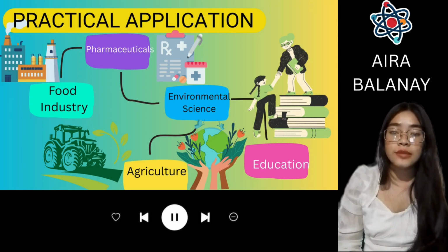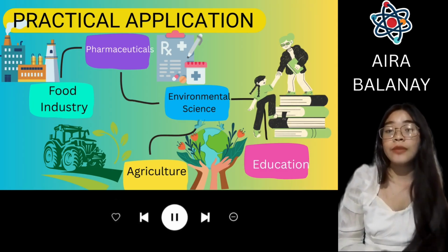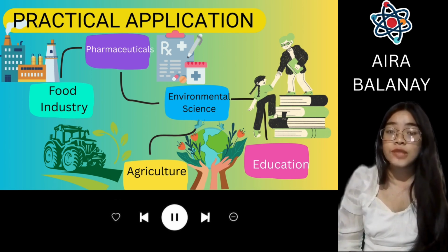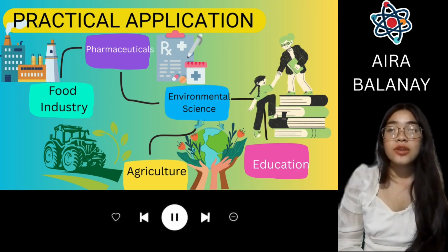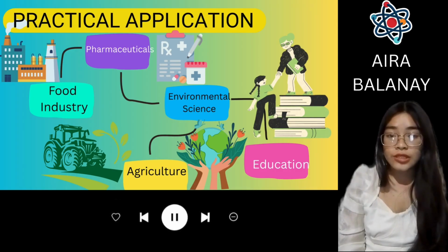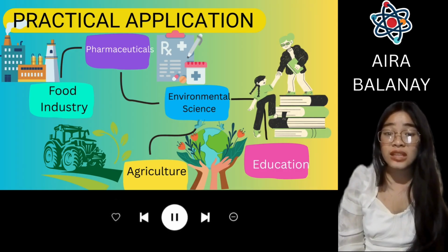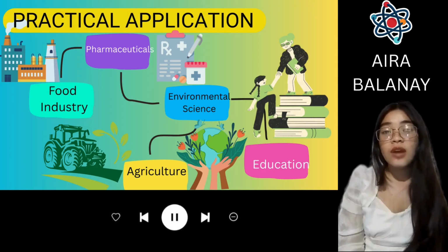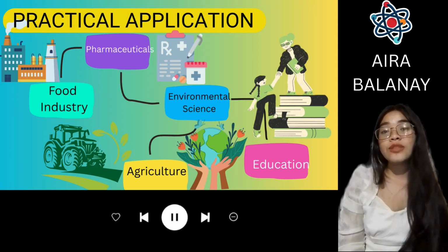Angiotensin 2 receptor antagonists are medications that treat high blood pressure, heart failure, and also chronic kidney disease, especially in patients with diabetes. They work to block the action of angiotensin 2, the hormone that narrows blood vessels and raises blood pressure. In pharmaceutical preparations, this method relies on direct acid-base titration.